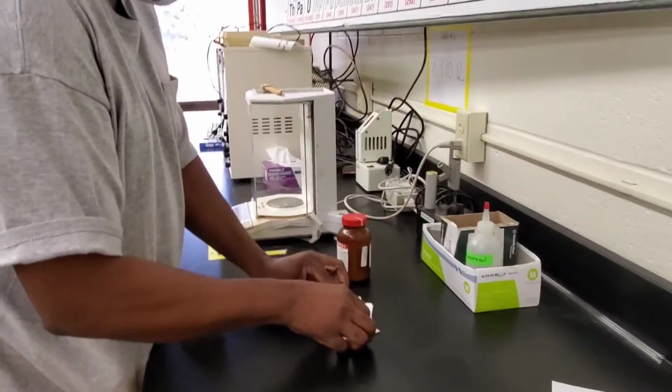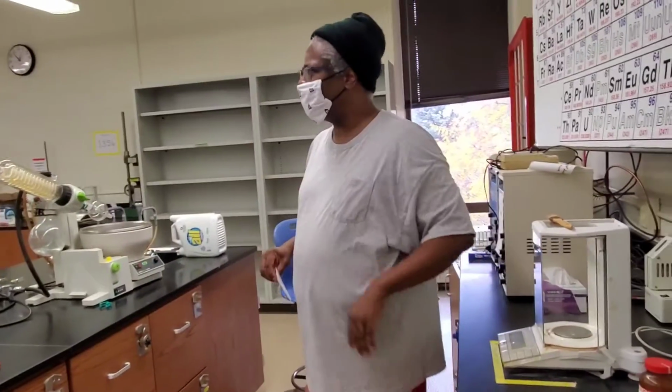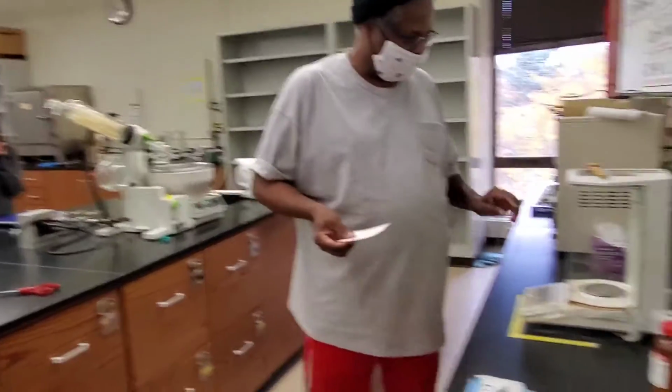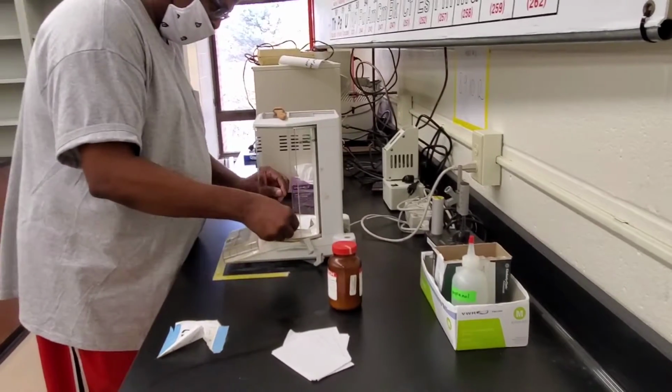What I would suggest, and this is going to be, is anybody using lithium hydride by chance? Lithium hydride? No. Okay, that's a good thing. Did you use lithium hydride? No, I use calcium hydride. Calcium hydride.